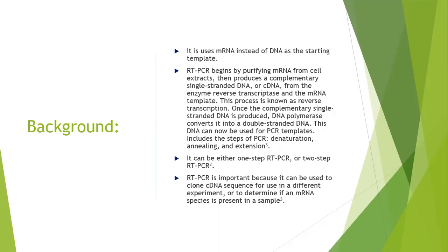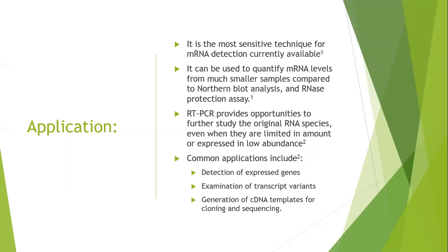RT-PCR is important because it can be used to clone cDNA sequence for use in a different experiment or to determine if an mRNA species is present in a sample. So RT-PCR is the most sensitive technique for mRNA detection currently available.